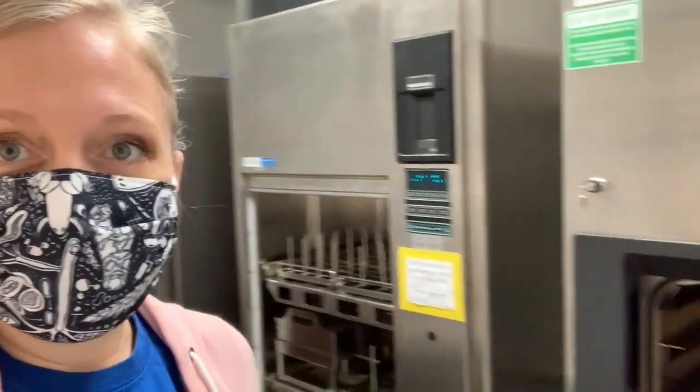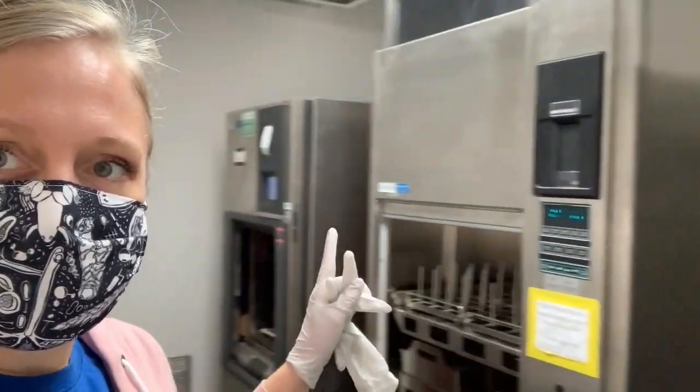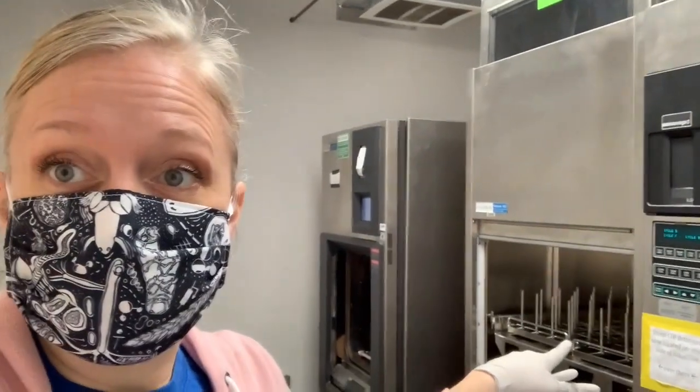So I'm in the 6th floor autoclave room. It's really loud. It has 2 autoclaves, one here and one there, with a dishwasher in the middle. And so this is where we come to autoclave most of our stuff.